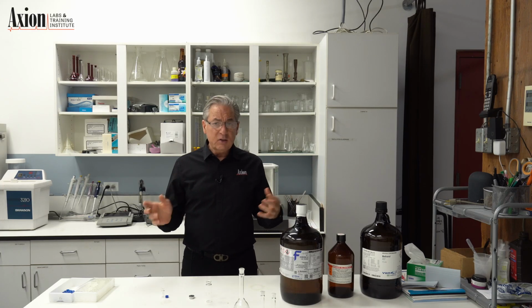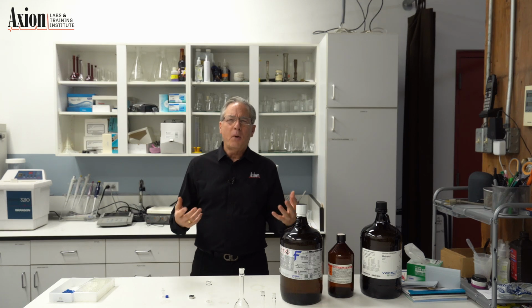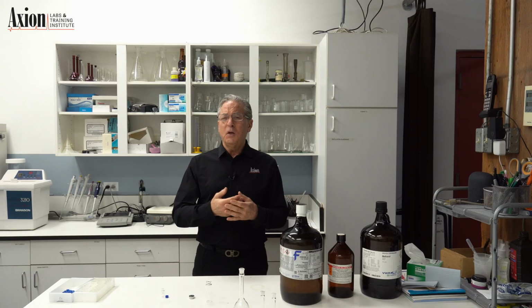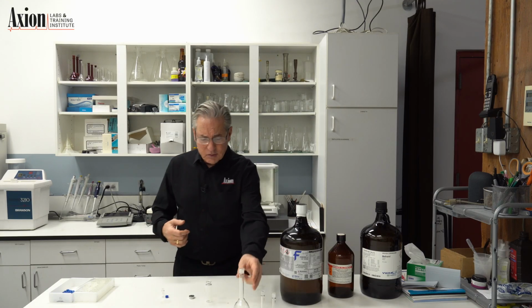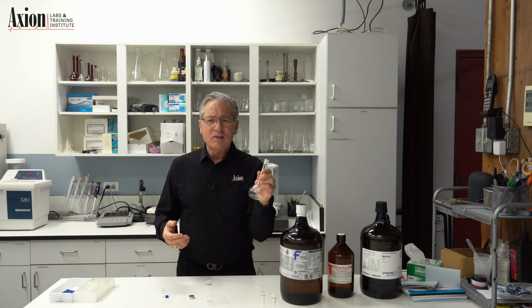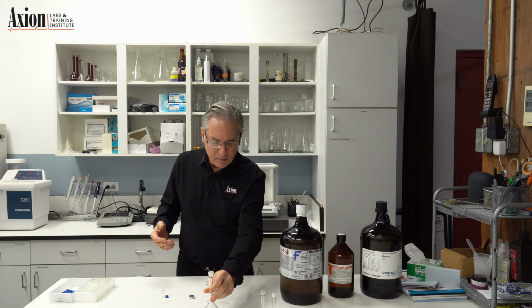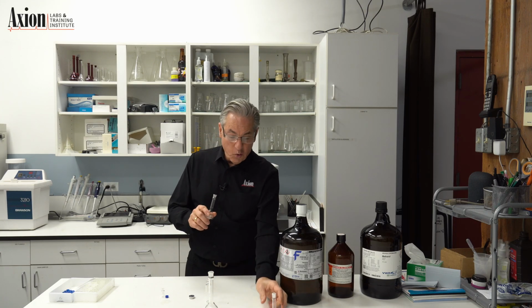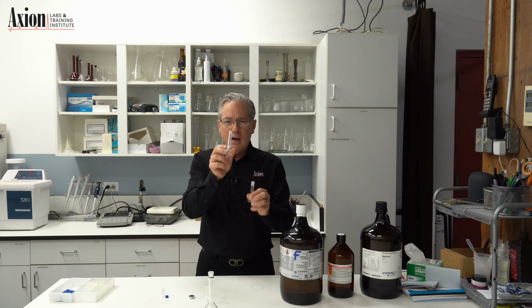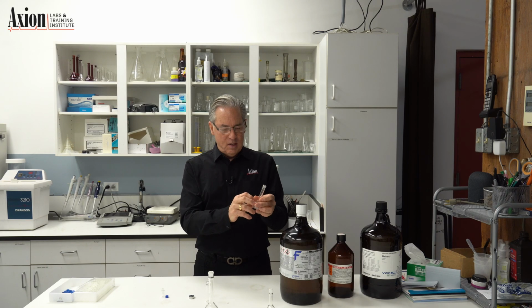So typically, we're going to take your sample, dissolve it in a solvent, and then inject that. I'll give you some ballpark ideas. I would look at making a 1% solution, which means 1 gram in 100 mils. So weigh out a gram, take it up to 100 mils. There's your 1% solution. 100 mils is a lot for me to work with. It's not to work with, but to get rid of, to be able to throw away. So I prefer working on a 25 mil or even a 10 mil. I don't go below 10. I've got some 5 mil ones. I don't really trust them as much, but I use this one a lot. So 25 mil volumetric, which means you put in 0.25 grams, dilute up to the mark.